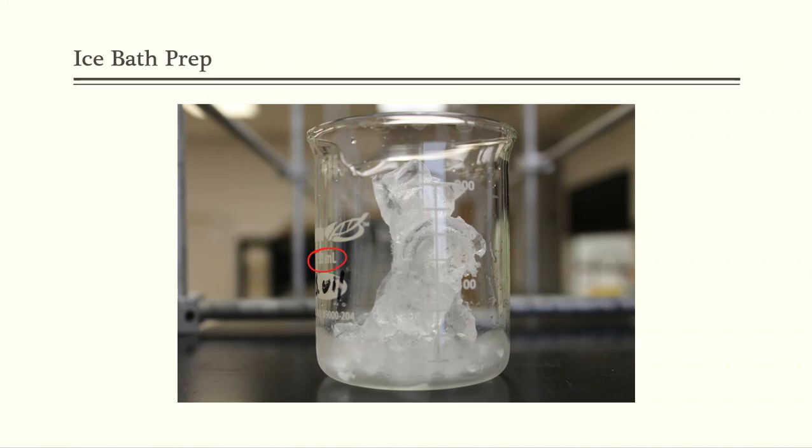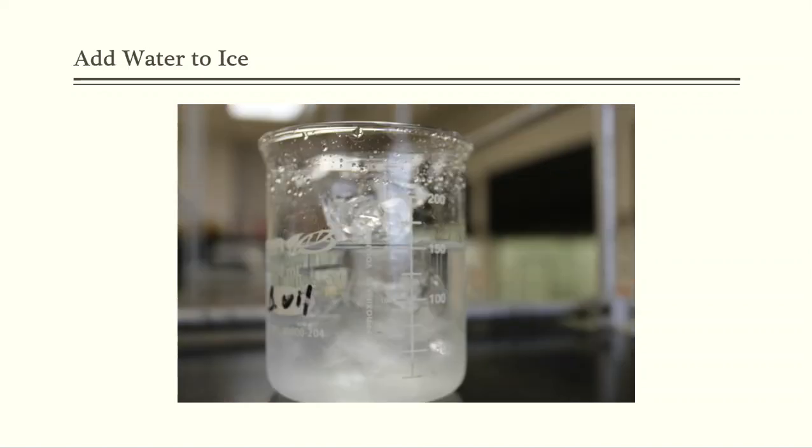So that's what you're seeing here in the picture, but that's not really a proper ice bath. That is just ice in a beaker. An ice bath actually adds some water to that ice. So now we have a super cold solution that we have ready, that when we need to use it, it is there and it is cold and it's going to do the purpose that we need it to do. And that I'll show you a little bit later on.